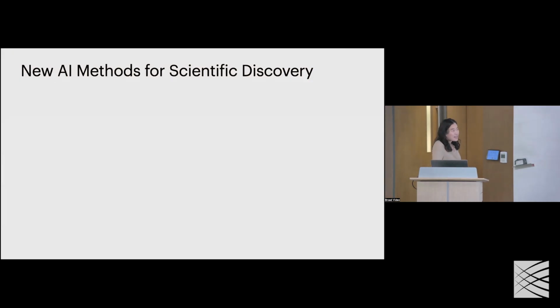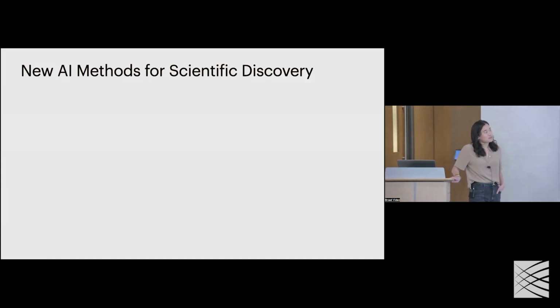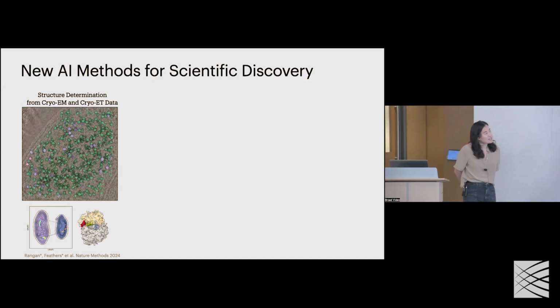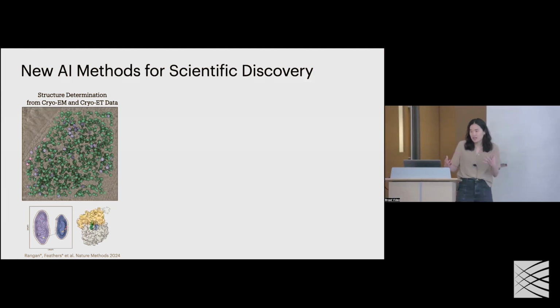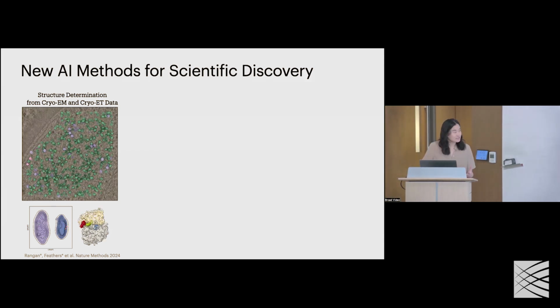At a high level, the motivation of the methods that our group develops is to develop computational methods to push forward scientific discovery. And definitely something that we have been talking about, and what I will talk about today, is how we can develop methods for cryo-EM and cryo-ET data analysis, in particular extracting the conformational ensembles of these macromolecular machines in situ.